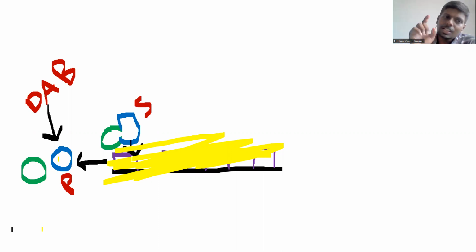Okay, so this is how we are going to measure enzymatic activity indirectly by adding substrate. The higher the color production, the higher the number of enzyme molecules present in the tissue. So this is the basic idea of enzyme histochemistry. We have a target enzyme reacted with substrate, and the substrate breaks down into product. Now this product will be visualized by various techniques.